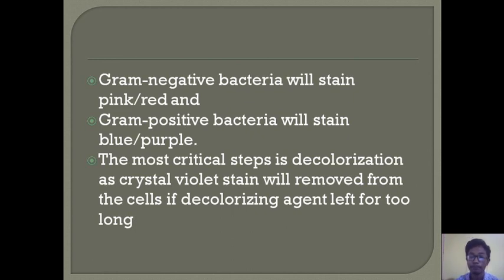So this is how we have to report this practical. If it is blue or purple, we have to report that the provided microorganism is a gram positive bacteria, or if the color is showing pink or red, then we have to report that it is a gram negative bacteria.